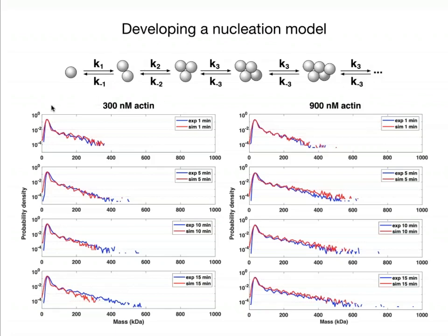And now we can take the information that we have from our experimental distribution and determine the relative abundances of all these species at the start of the reaction, feed it into our simulation, and then run a simulated reaction and see whether our simulation, here designated by the red curves, arrives at our experimental distribution at later time points.